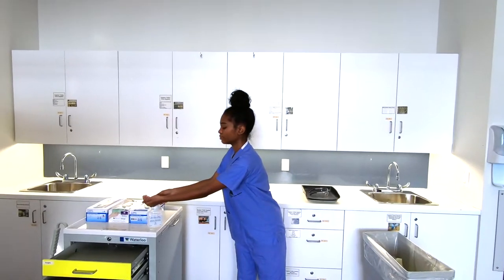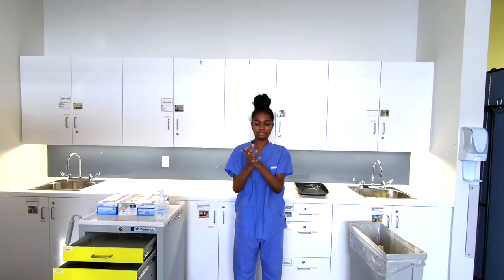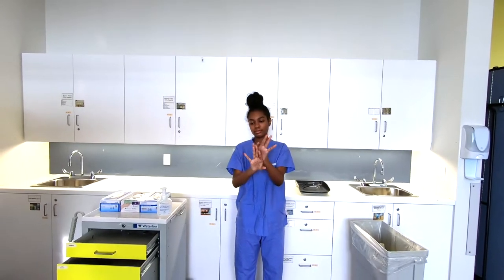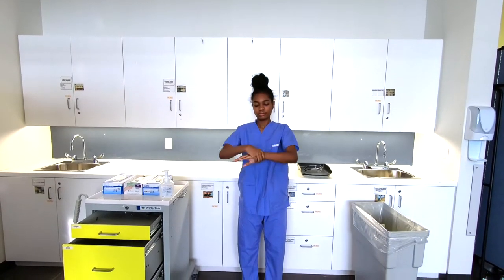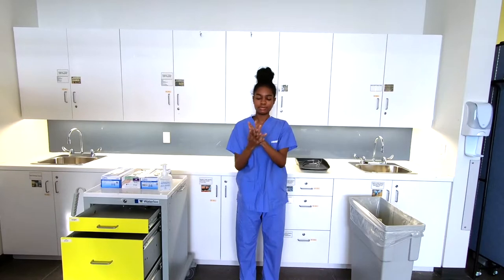Now perform hand hygiene. PPE has now been safely removed.